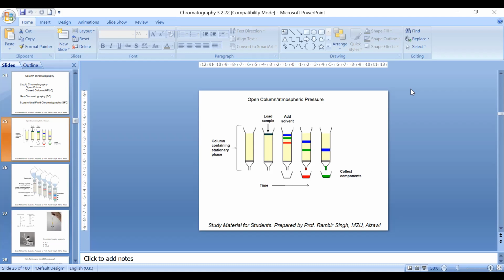But it was a misleading word. Like we say that 50 is medium and 51 is high. That was misleading. And the word HPLC became very popular. So the word pressure was replaced by performance. The abbreviation remains the same, HPLC is the same. The word pressure is replaced by performance. Why did we replace it by performance?